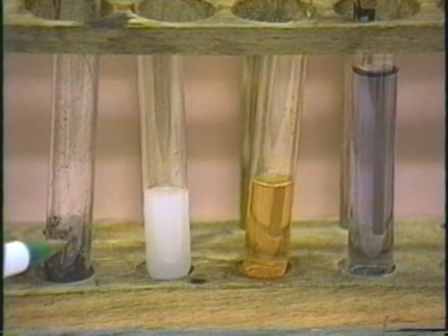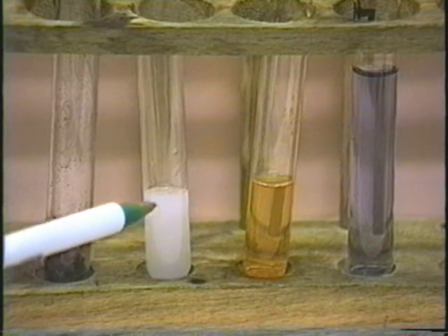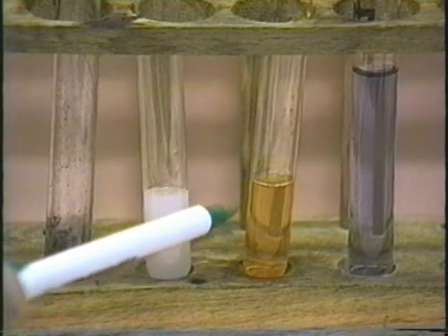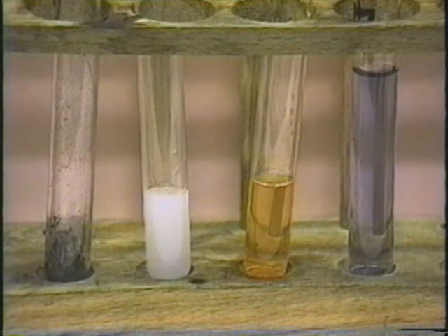So there are the results of our analysis. For mercury, we get a confirmatory black precipitate. For silver, we get a confirmatory milky white precipitate. And for lead, we get only a clear yellow-orange solution. Therefore, there is an absence of lead.